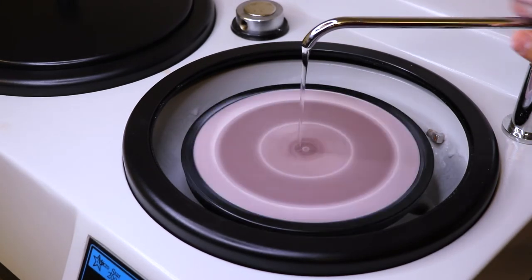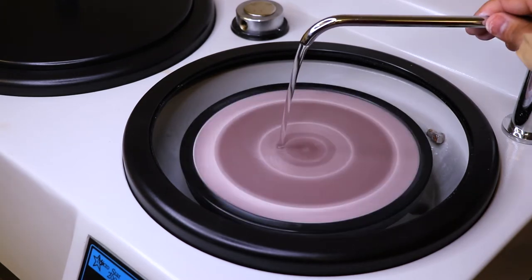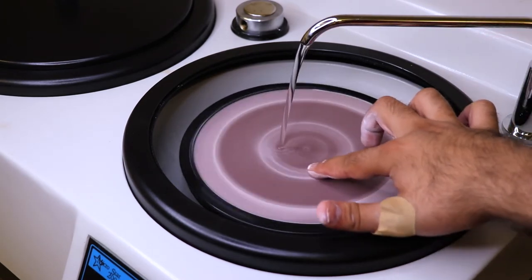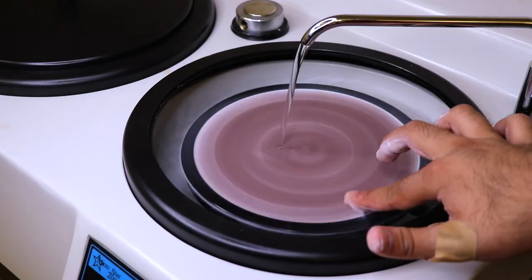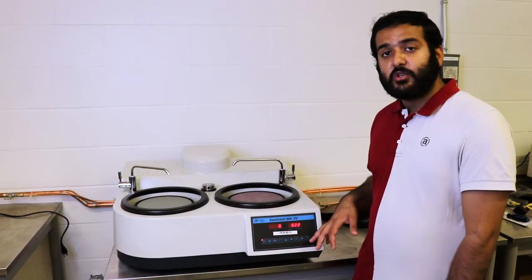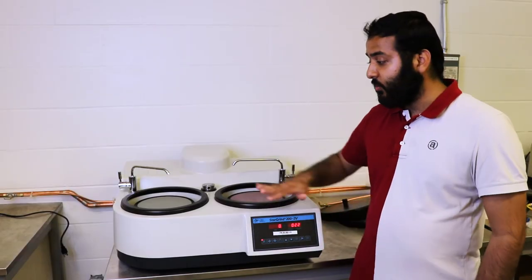You can also run this while you're polishing your sample, so that anything that comes off your sample is cleaned immediately. In either case, you clean the machine just do that once or twice. You can even take a damp cloth and wipe down any areas that the water can't get to.